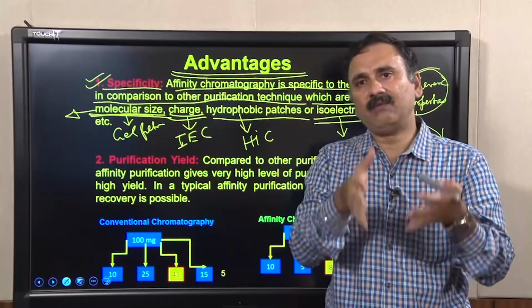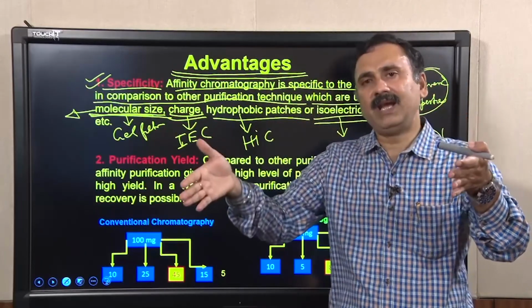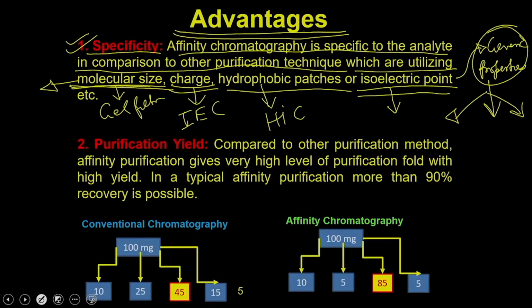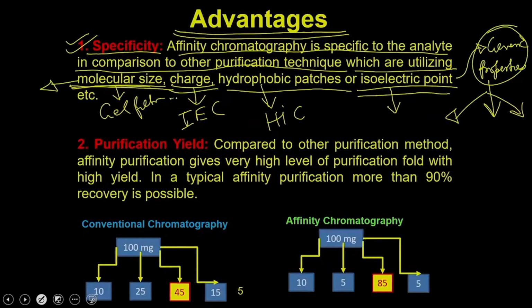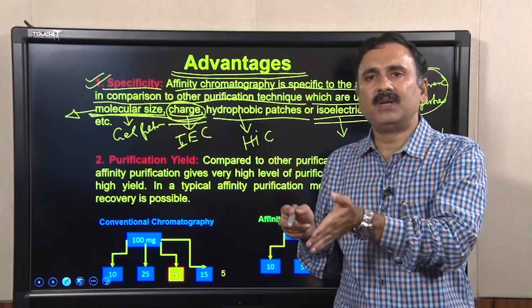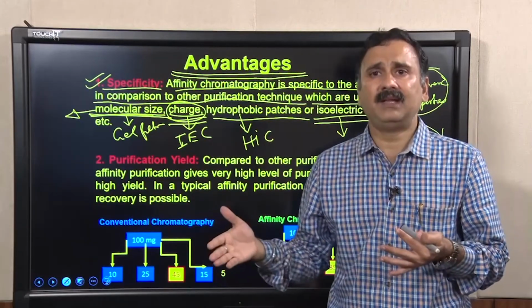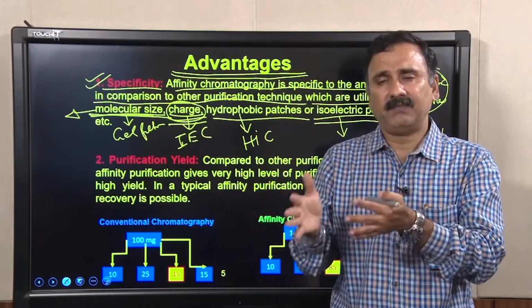It will give you analytes falling within the range of 10 to 50 kDa, so you get multiple analytes. Similarly, with ion exchange chromatography, if you utilize the charge, the same phenomenon applies. Multiple proteins will have different amounts of charge, and you can use ion exchange chromatography to purify, but you cannot purify the particular analyte.